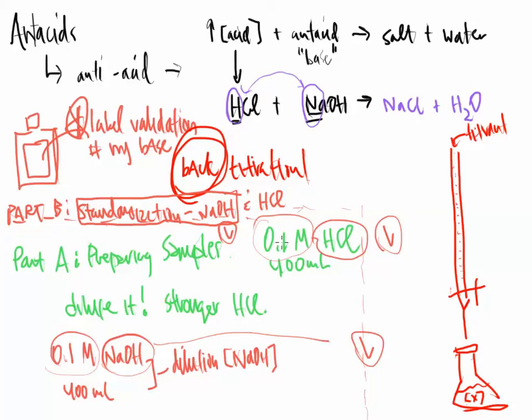You have not standardized hydrochloric acid though. So this is something that we want you to go through. We want you to learn how to standardize an acid. Not just NaOH, but an acid now. Something a little bit different. So in the lab directions, you are going to look at step number 8. And step number 8 is going to talk about this whole concept of putting hydrochloric acid in the burette, and then in the Erlenmeyer flask down below, it wants you to put your sodium hydroxide.